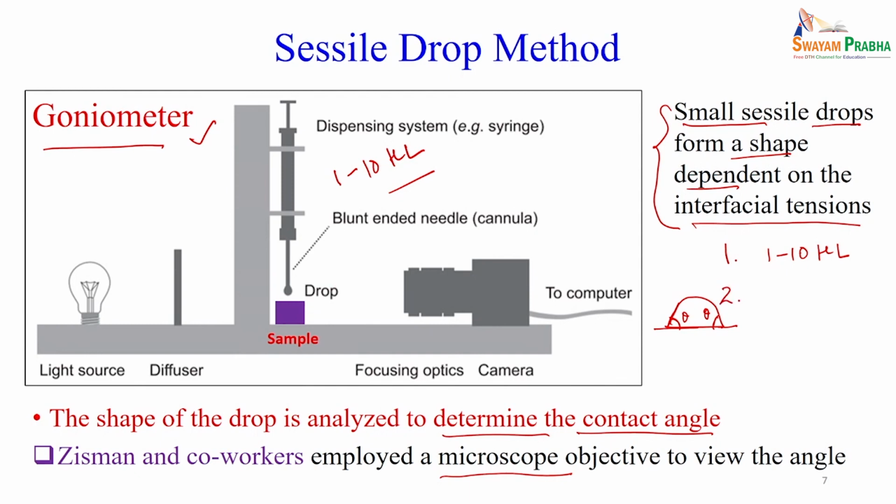the effect of environmental factors, or external factors like temperature. If you put a drop on the surface, the liquid will try to evaporate with time and temperature. Both are factors, time as well as temperature.